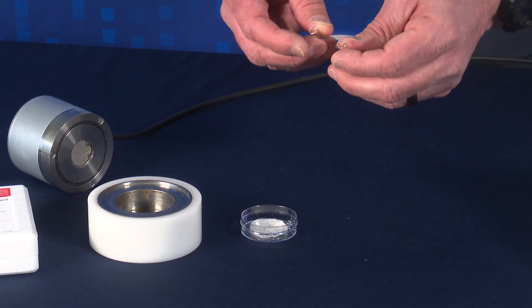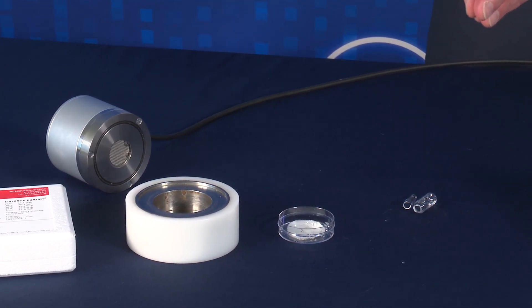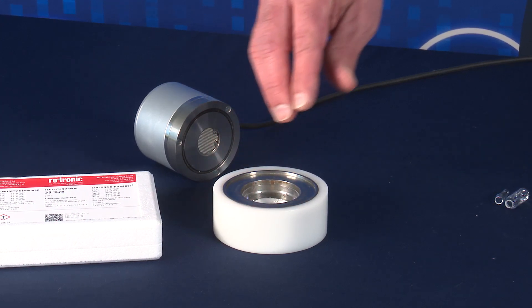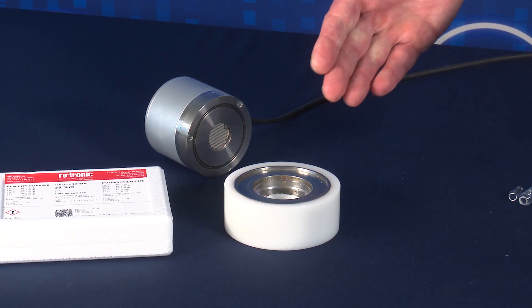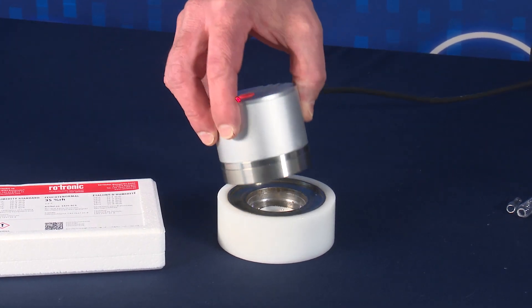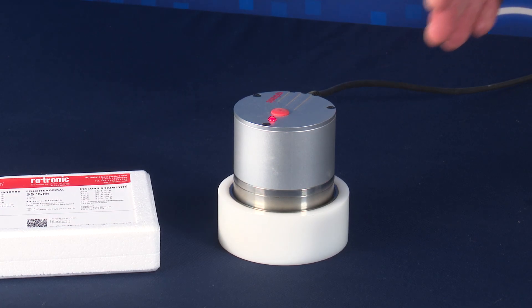Once you've emptied the contents completely, carefully discard the glass ampule. Simply place the sample cup into the sample cup holder with the cover removed, then place your Rotronic Water Activity Probe on top of the sample cup holder so that it fits firmly and snugly.